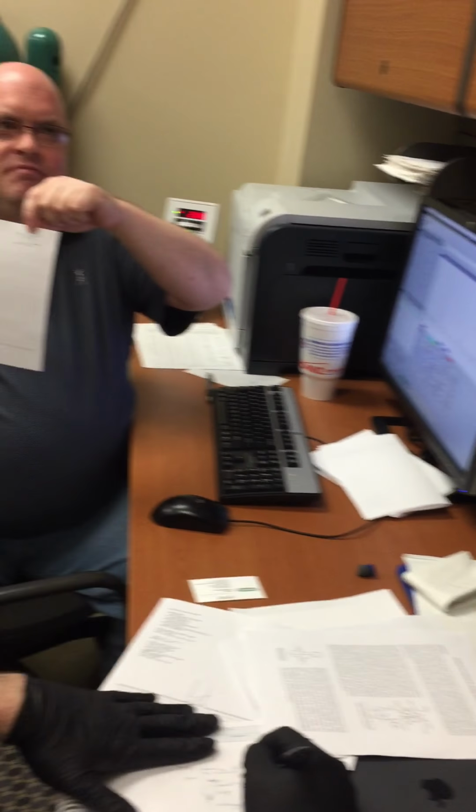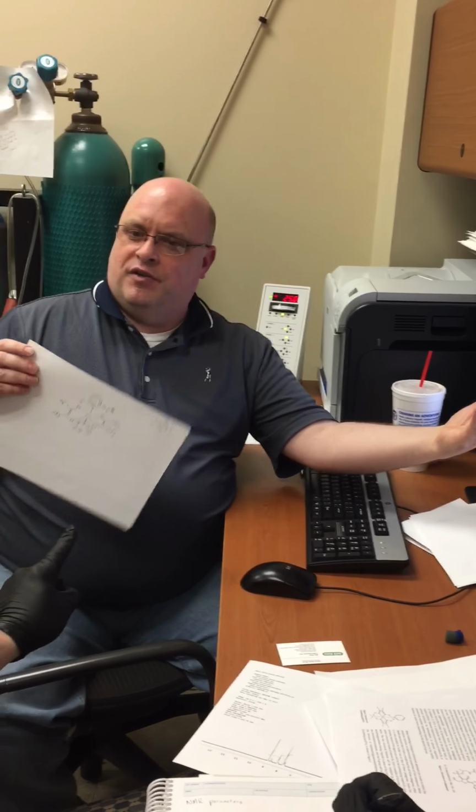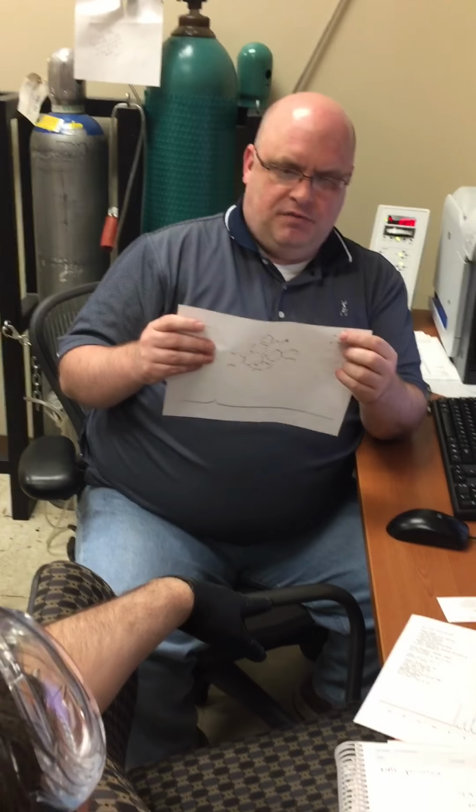For every group, I'm going to print this off and give you multiple copies. I'll have one with the whole spectrum, and then I'm going to zoom in like I did here on all these regions. So the middle one would have a large signal? The meta one's going to be the bigger one.